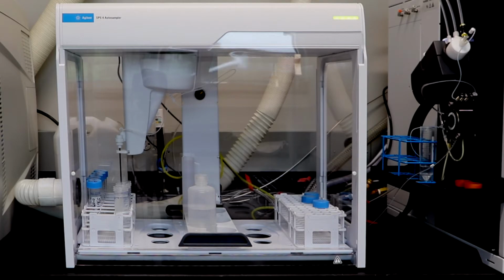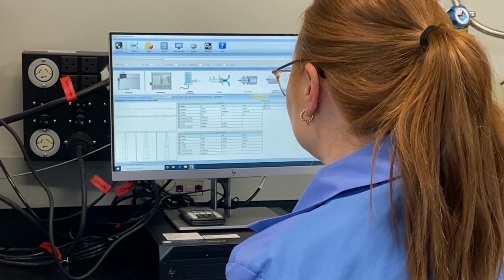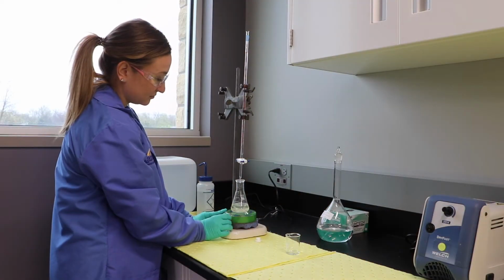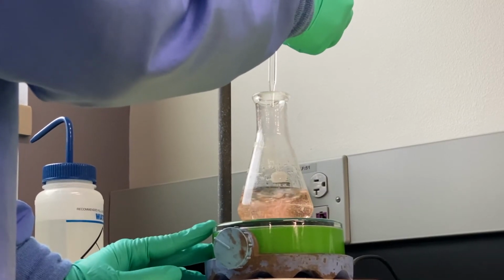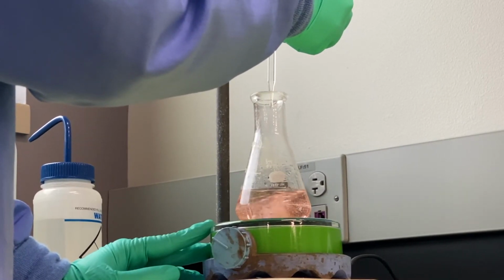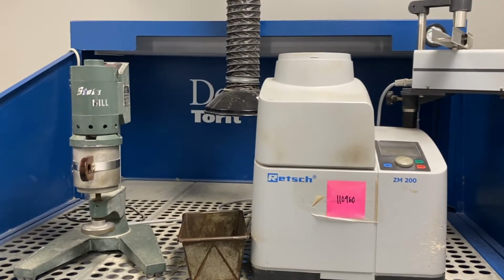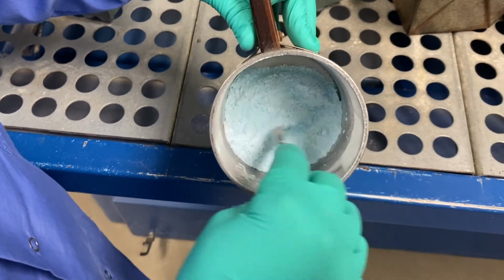We test livestock and pet foods for threats like aflatoxin, which can be life-threatening if consumed by animals. This lab also conducts testing to verify labeling claims of feed and fertilizer products, like testing for nitrogen, potash, phosphorus, and sulfur. The Feed and Fertilizer Lab is critical to protecting animal and plant health, as well as providing economic protection for consumers.